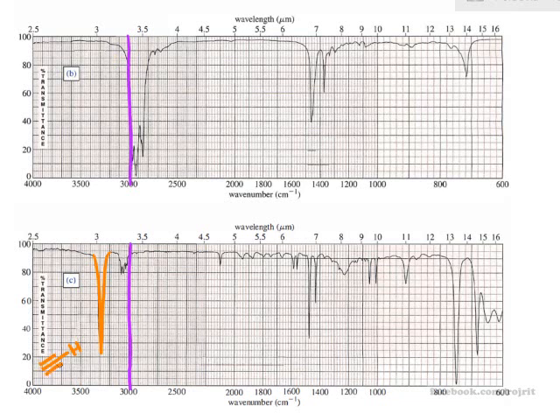And as I said, if you have the terminal alkyne, you have to confirm that with the triple bond C, which is actually about 2000 something, right? But this graph is not very good, actually, because this is 2200.